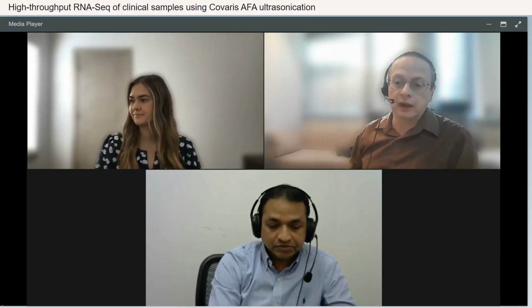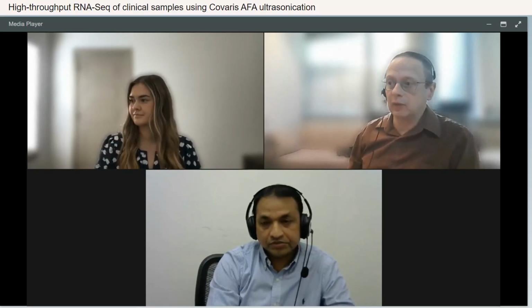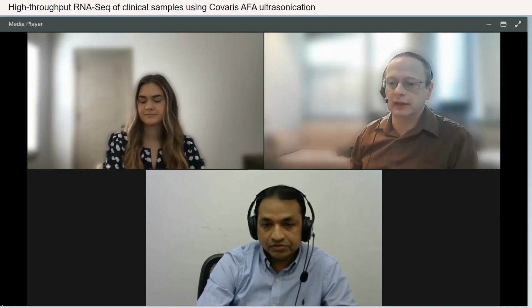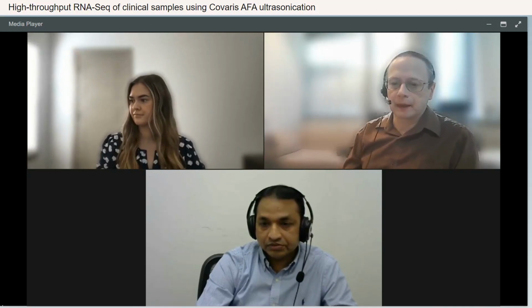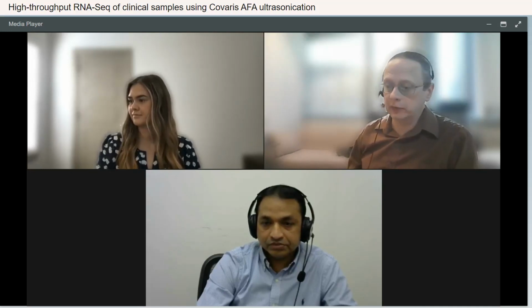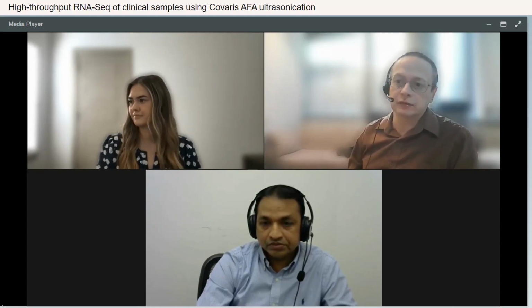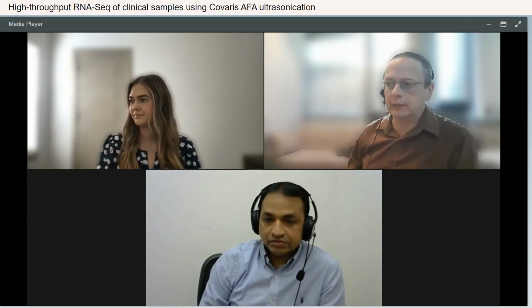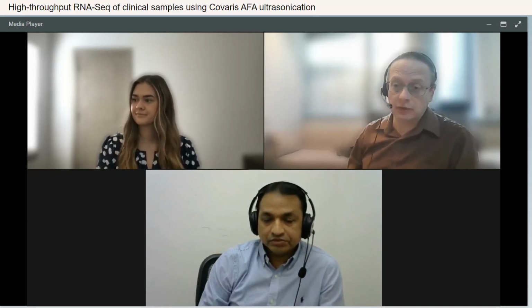What's the rate of transcription, which is more correlated with the genome? What's the rate of destruction? What's the rate of translation? Looking at small RNAs is an area where the current technologies are very limited. We've done some work looking at that, and we do not get an absolute measurement of small RNAs. And so we see very little of it actively in our lab, mostly because it costs about the same as total RNA-seq, and you're not getting anywhere near as much information.